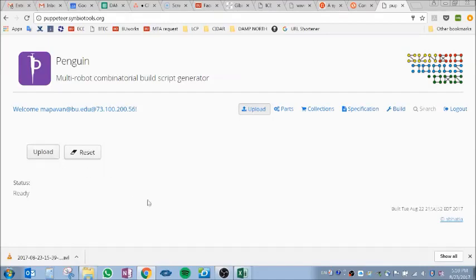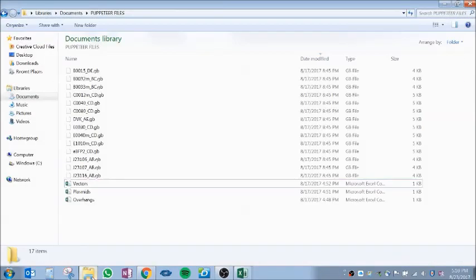Let's prepare the files to be uploaded. You should have your parts as GenBank files, also 3 CSV files, one for the vectors, one for the plasmids, and one for the overhangs. In this case, we are going to use the modular cloning methodology as an example.